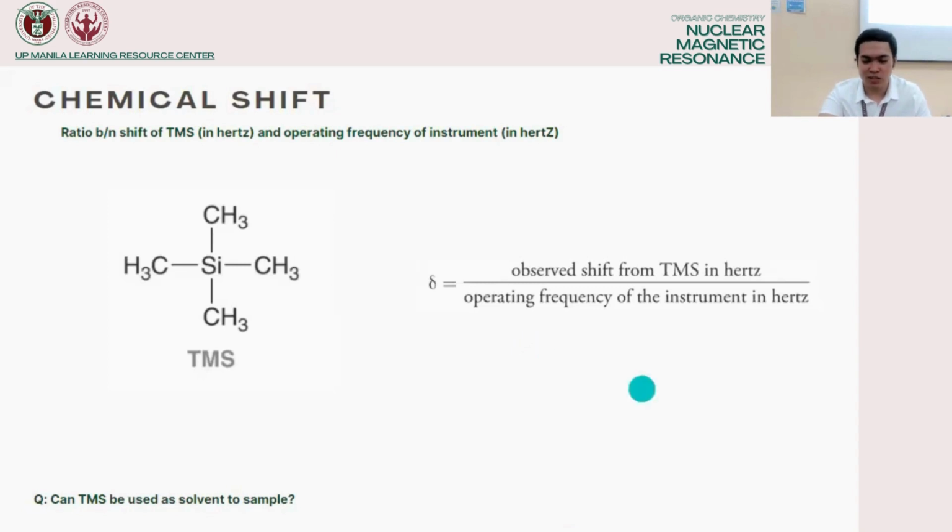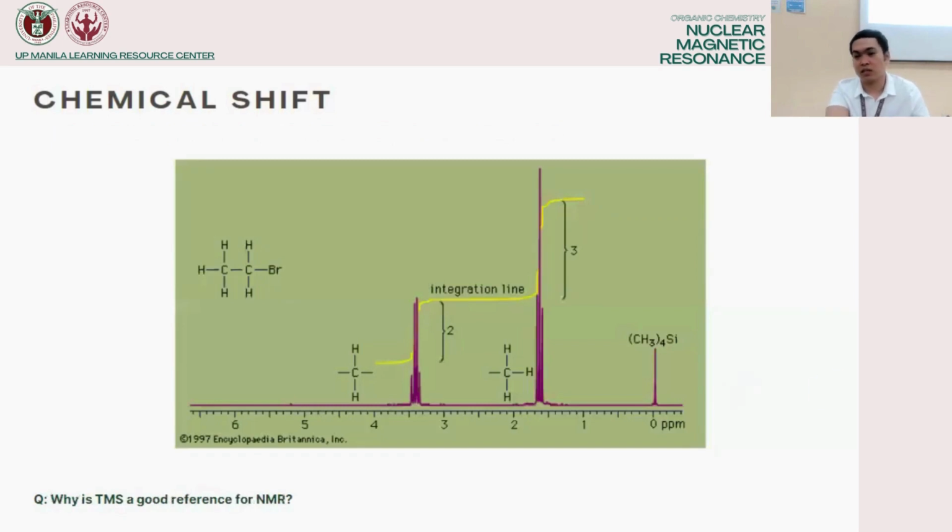So, TMS actually is used as a reference. It's a good reference because ang ganda ng kanyang signal and it's at 0 ppm. So, yun yung baseline natin. Okay?